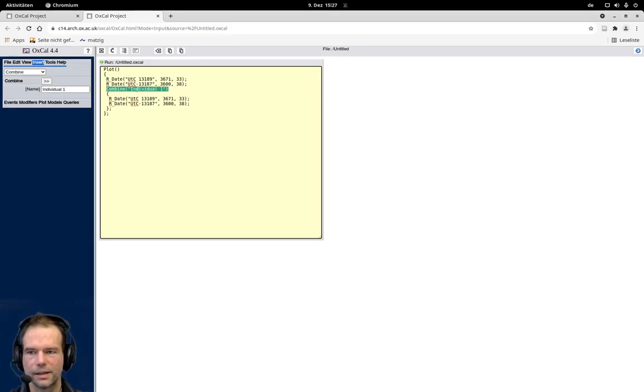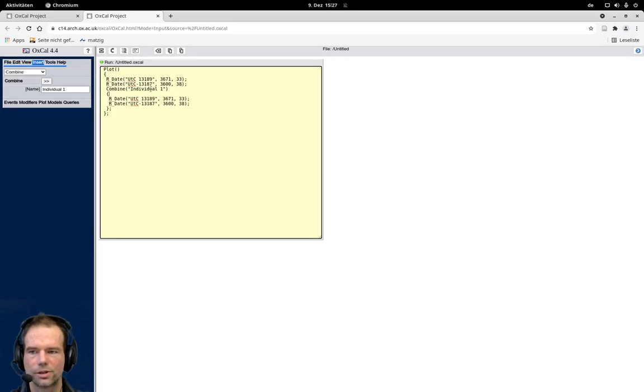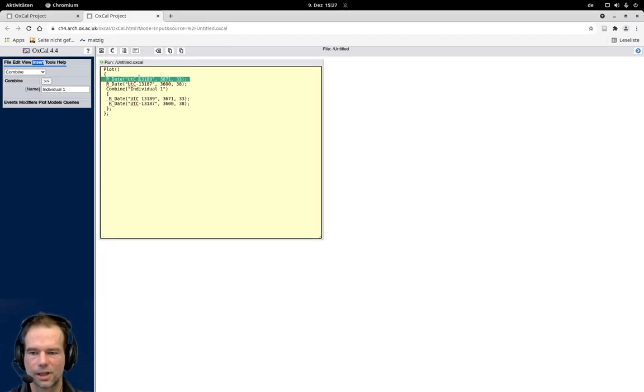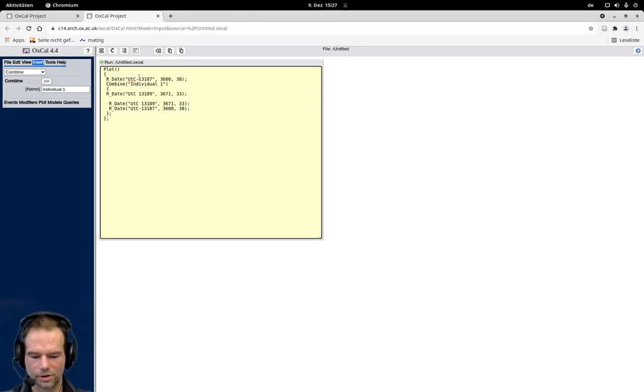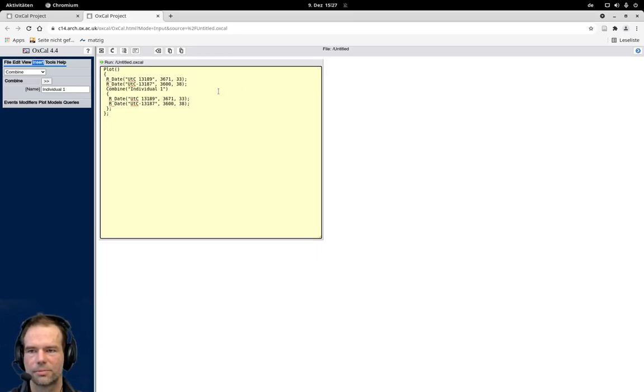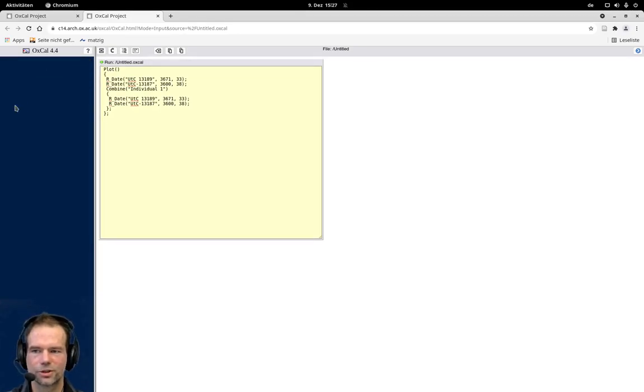And then we have combine, and in the round brackets the name of the combined result. And then we have these curly brackets, and inside of these curly brackets are the individual dates here. So you could directly type into the code, or you can see the code here after you inserted it, and for example copy and paste code directly back and forth here. And most of the time that's much faster than do that with this graphical user interface.